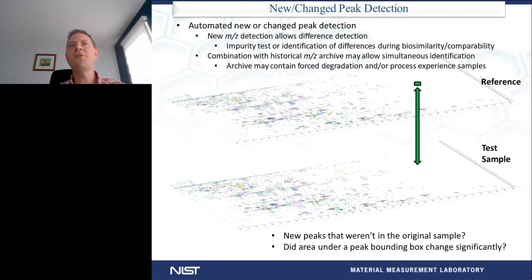So then we can do new and change peak detection that I mentioned before. So once we have those bounding boxes in the previous slide, we can actually quantify, again, on routine samples and test samples, how much of the material has actually deamidated and in which fashion. But we're then having bounding boxes, for example, in the reference slide here. We're not actually using the entirety of this space, right? There's a lot of white space where we don't have any signals.